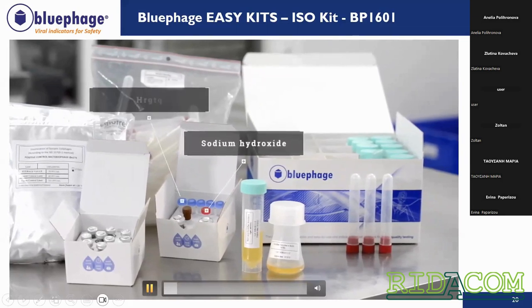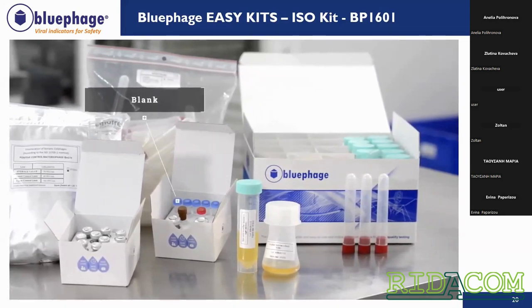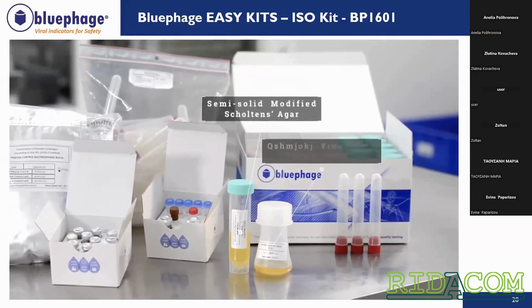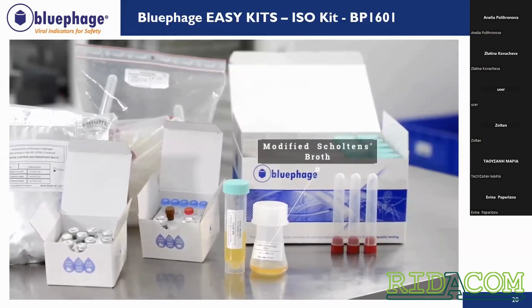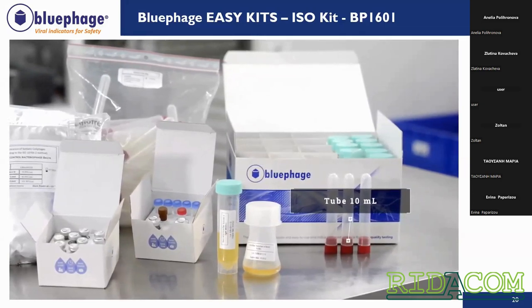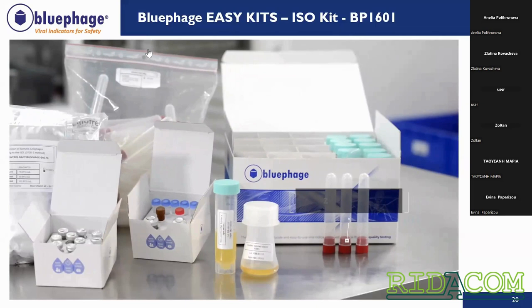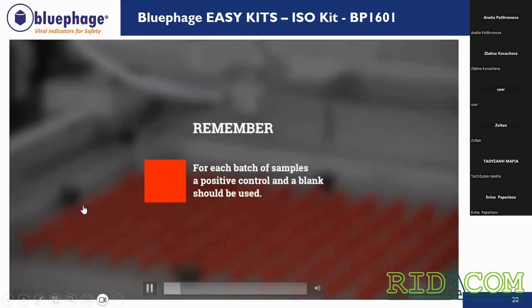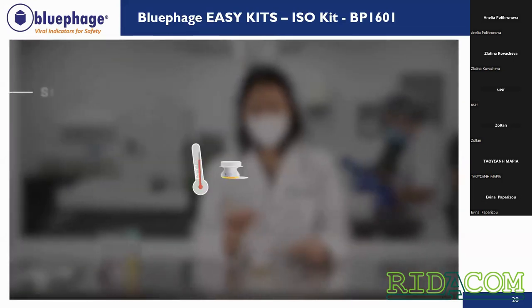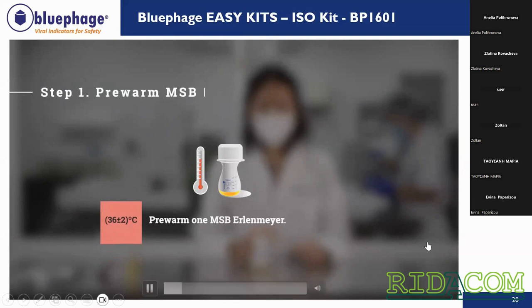Sodium hydroxide to prepare the nalidixic acid, some blanks, flasks with the semi-solid MSA, Erlenmeyers with MSB, and the empty test tubes for the analysis. This video is being made for training purposes, so it's important to always perform a blank and a positive control in each batch of samples.